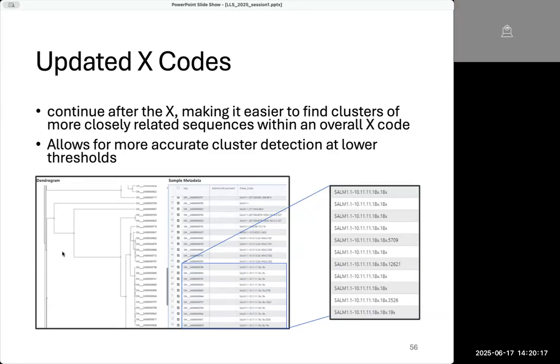If the bars are vertical like that, it's a little hard to tell what is fully vertical and what is slightly not fully vertical. And that's the whole scale of it, right? If this bar is 500 SNPs, even if they look vertical here, they might not be. But if this is 5 SNPs, then these are probably zero, right? Or not SNPs, sorry, alleles. But yeah, I think it depends on the scale.